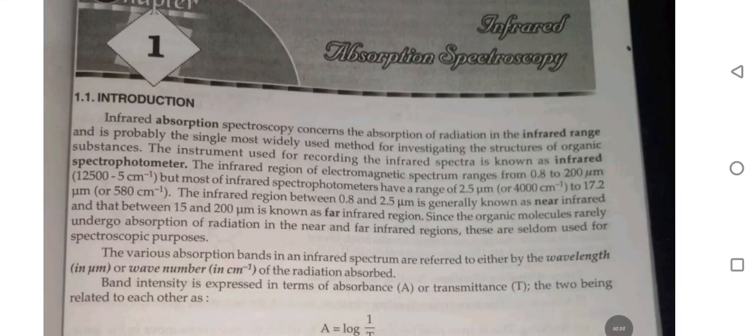Chapter 1, Infrared Absorption Spectroscopy. Introduction. Infrared absorption spectroscopy concerns the absorption of radiation in the infrared range and is probably the single most widely used method for investigating the structure of organic substances. The instrument used for recording the infrared spectrum is known as an infrared spectrophotometer.